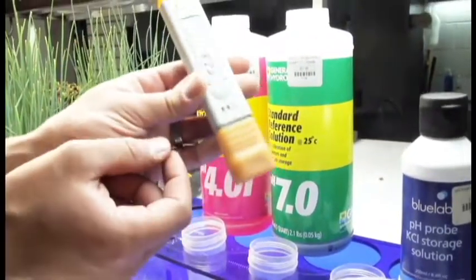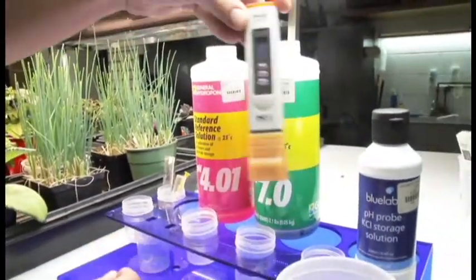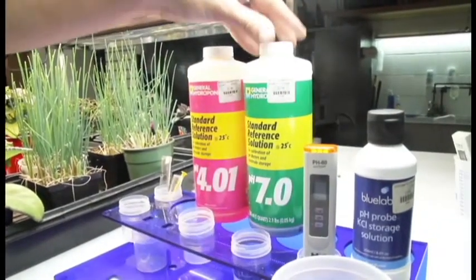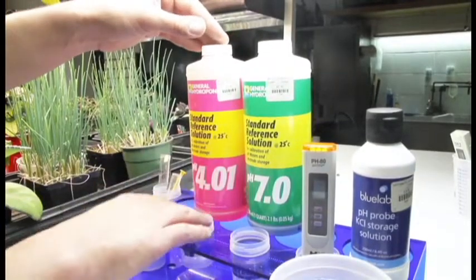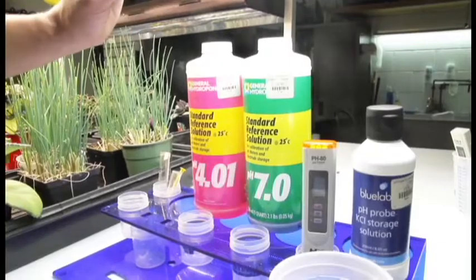The first thing we need to do is get the meter ready to calibrate. We're going to use our 4.0 and 7.0 calibration solutions. I like to leave my bottles behind the glass that I'm going to put the solution in, so I don't forget which solution is in which glass.